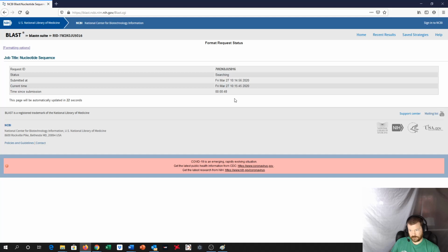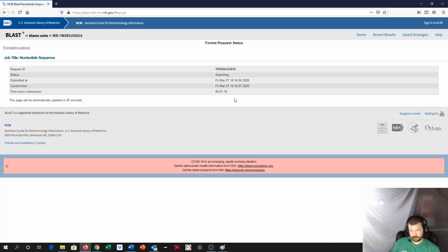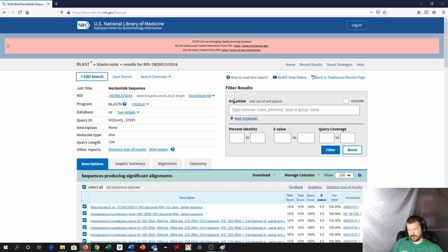I've done this one before, so I know it'll come up. Sometimes it'll take 2 or 3 minutes. This one shouldn't take but maybe a minute, minute and a half. Or 2 minutes. It's amazing how long 27 seconds feels when you're waiting on it. And so here we go.